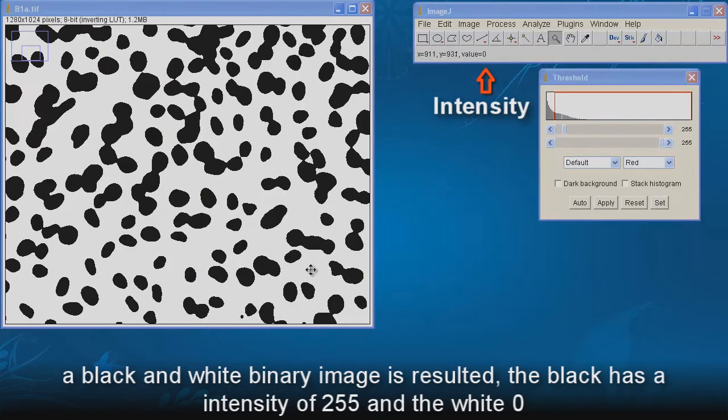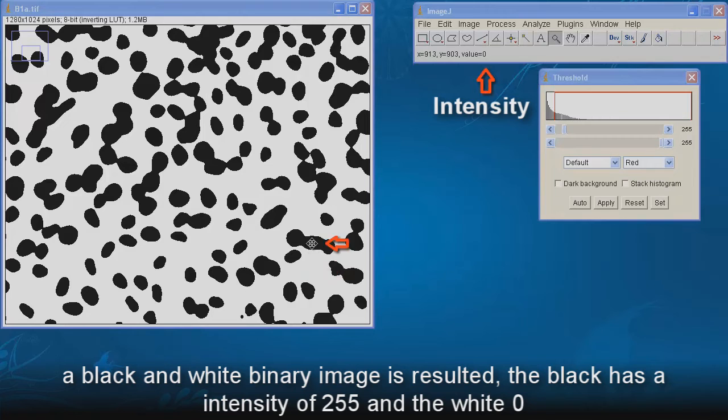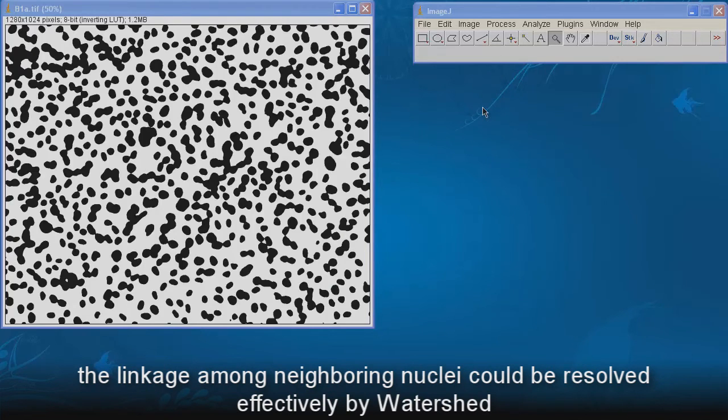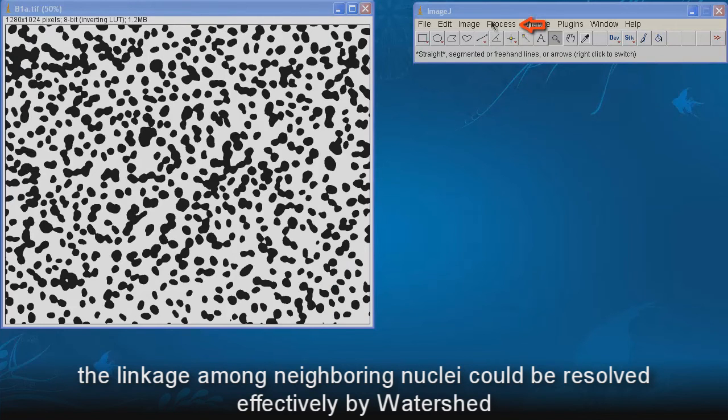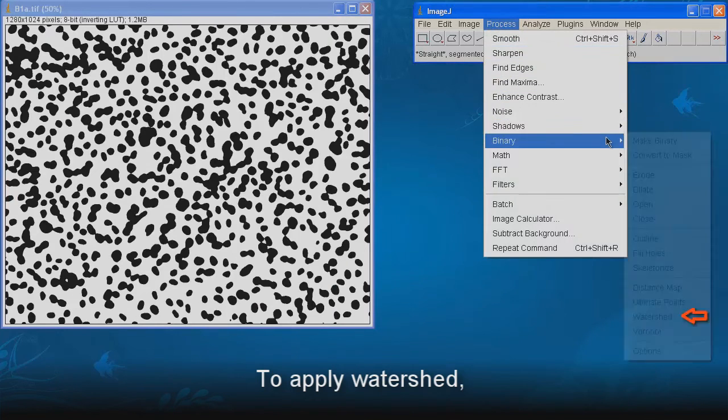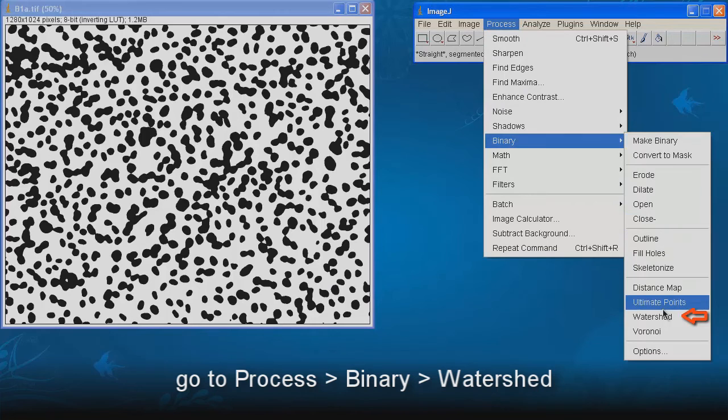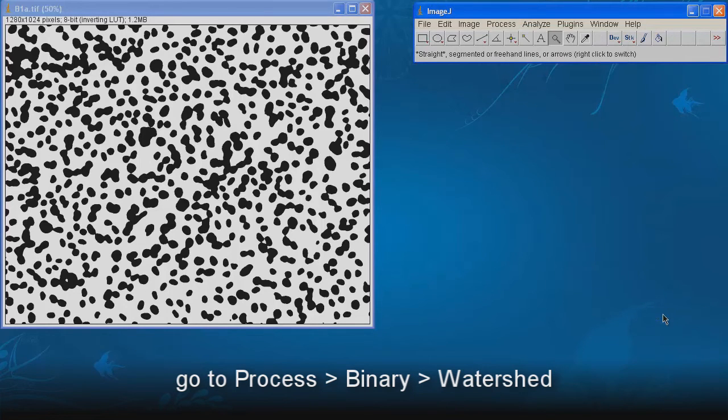A black and white binary image is resulted. The black has an intensity of 255, and the white 0. The linkage among neighboring nuclei could be resolved by watershed. To apply watershed, go to Process, Binary, Watershed.